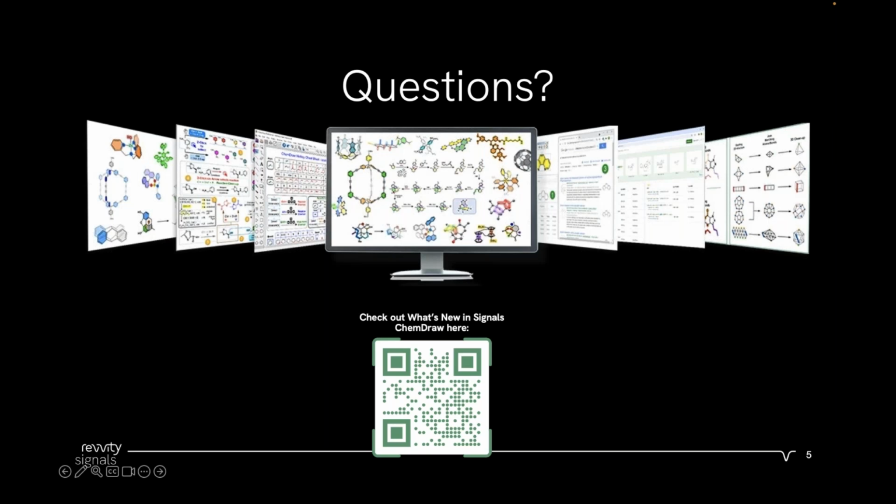And then there's a follow-up question: what kind of documents can it recognize? Is it mostly office files, things like that? Lindsay, feel free to jump in here. So yes, it is principally office files. You're talking about Word, Excel, PowerPoint. It also does read into SD files, and obviously your native ChemDraw files, your CDXMLs. PDF or image recognition doesn't extend to that.